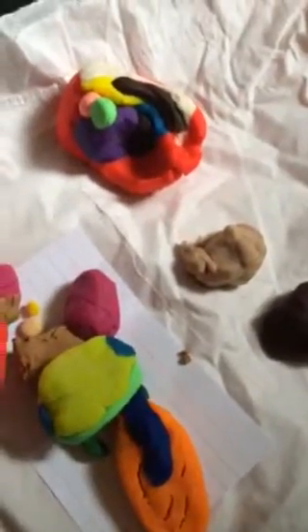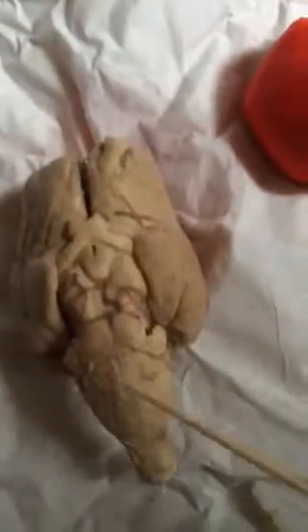I'm having a little trouble keeping mine together, but we flip this over to view the dorsal side. You'll see this is the pons. On my sheep's brain, that region is right here. You can see this is the fourth ventricle right here. On my clay model, fourth ventricle would be interior to this part.